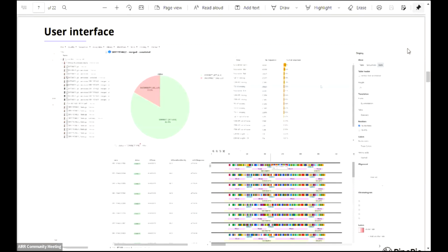In the top menu, you have access to all the tools. So that's around QC, of course, 10x QC, Sanger QC for secondary peak detection, and so on, and also all our analysis tools. So the annotation part of the pipeline, the clustering, the alignment, the differential enrichment, and so on. So all the tools are available there.